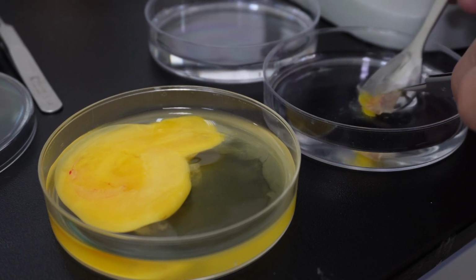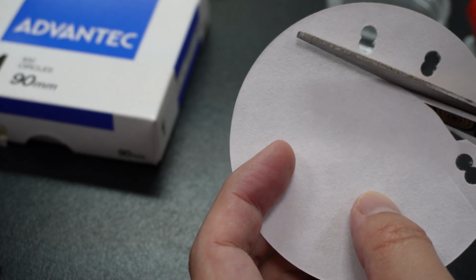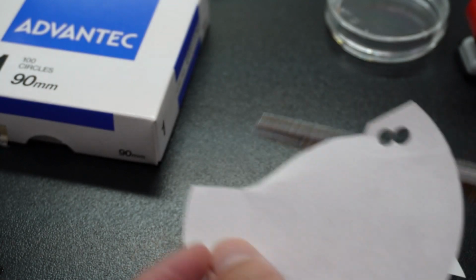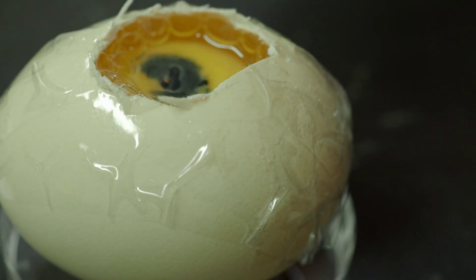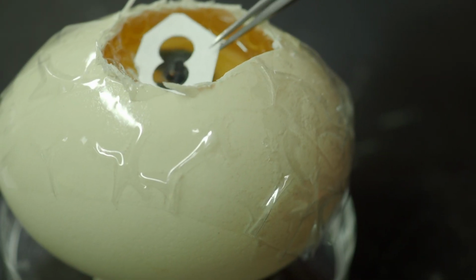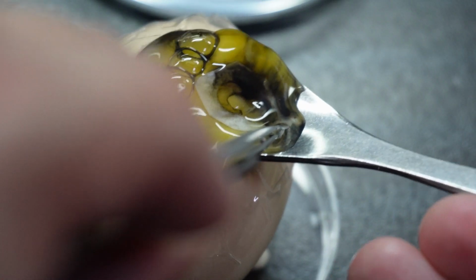Smaller, more fragile embryos need more care. The guide describes using filter paper. You punch a hole in a piece, carefully place the paper over the embryo. So the embryo sticks to the paper slightly. Right, it adheres just enough. Then you trim the paper around it and use that paper like a little raft. Wow. Yeah, use the paper raft to lift and transfer the embryo stably into the PBS dish using a spoon. It helps prevent it from folding or getting damaged.